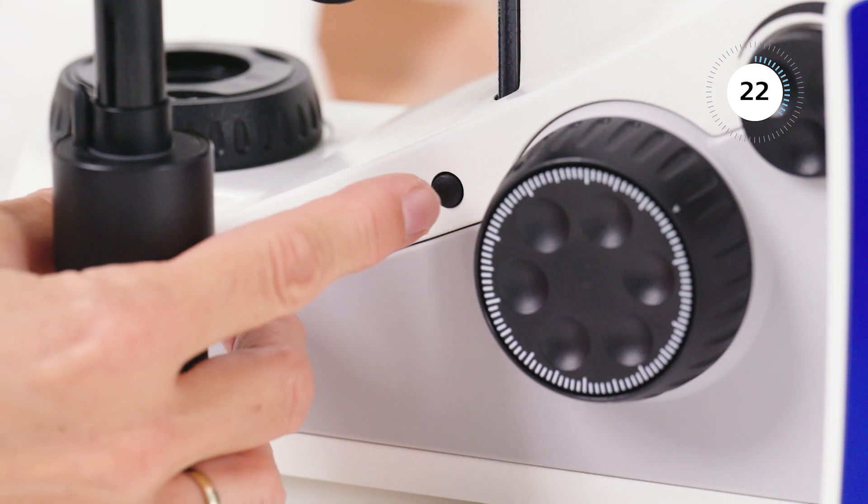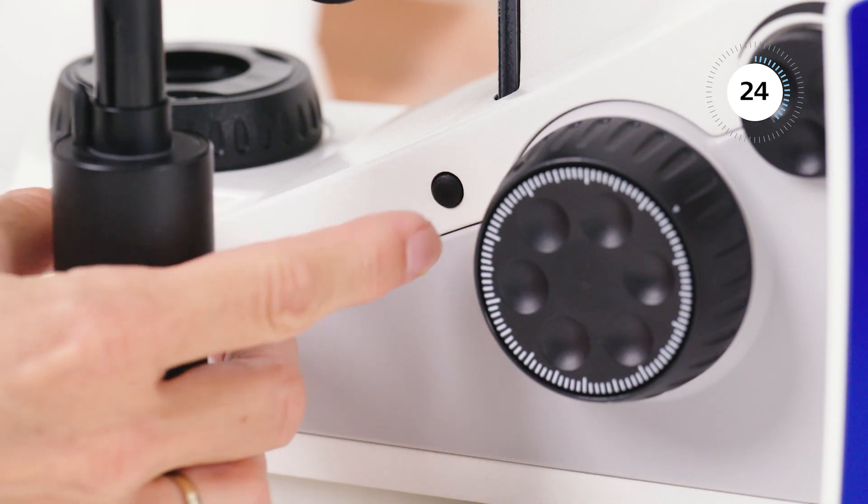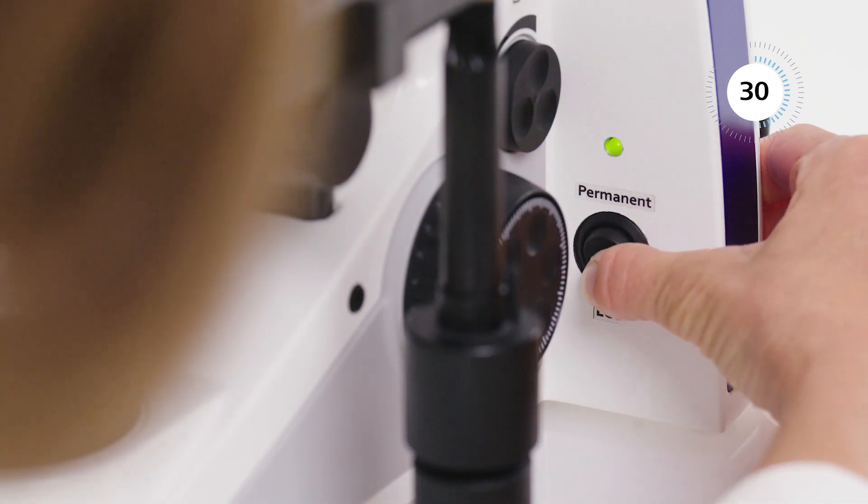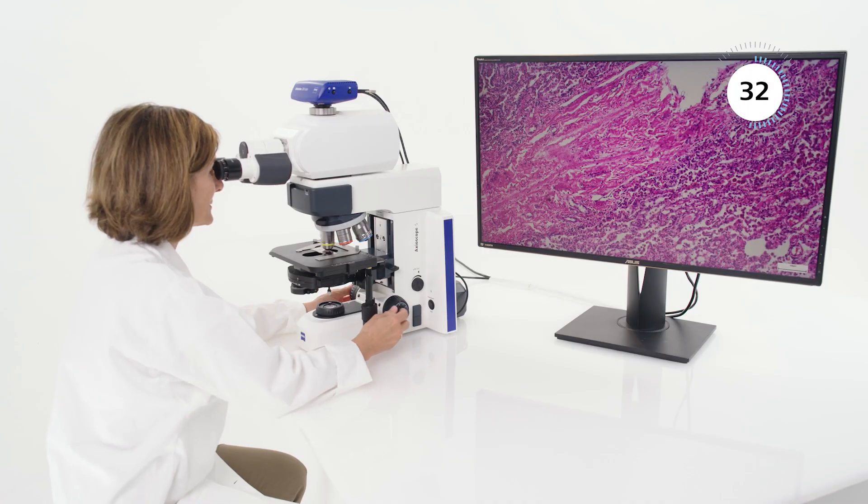With ergonomically positioned snap buttons, you acquire images and videos directly from the stand. Use eco mode and your microscope goes to standby after being idle for 15 minutes to save energy.